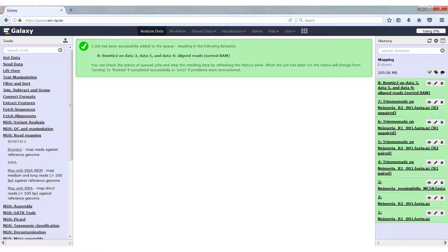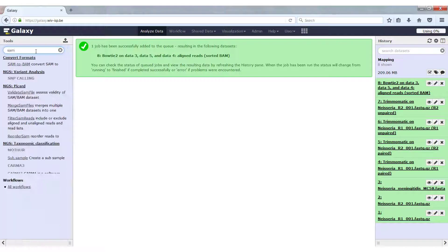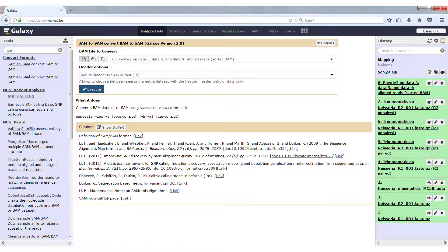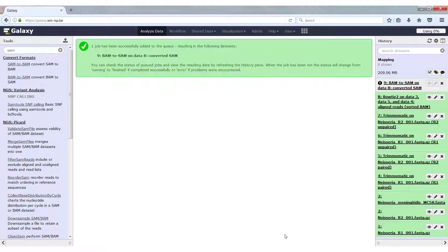If we do want to have a look at what's in this binary file in Galaxy, we can convert it into a human readable SAM format. To do this, we just search for the tool BAM to SAM. We select it, the correct input file is already selected, just click execute, and it will convert our BAM file, which is binary, into our SAM file, which is human readable. It has already converted.